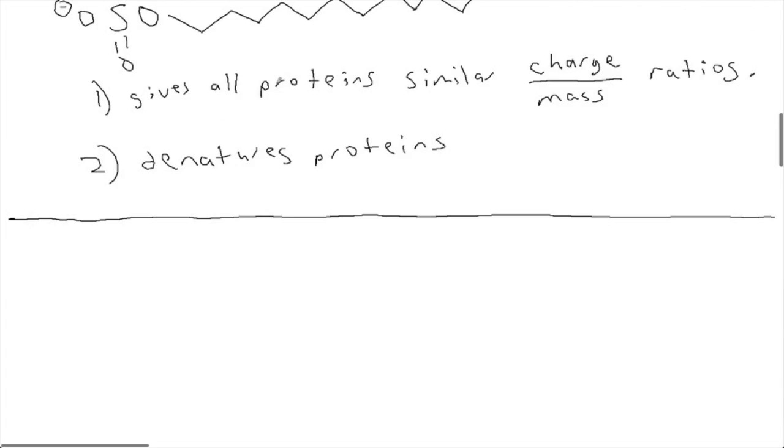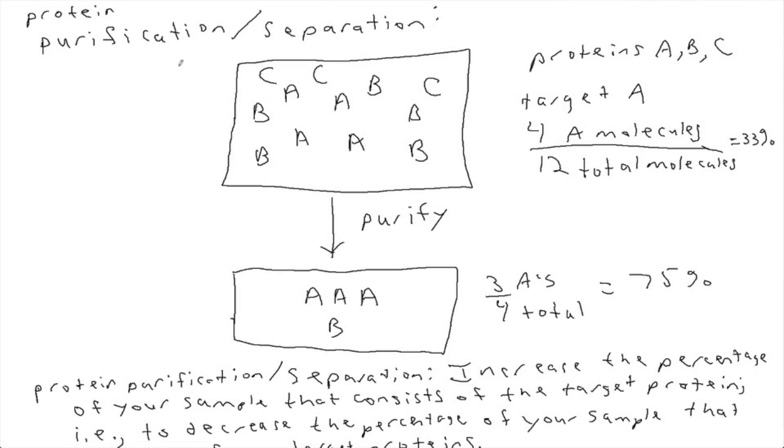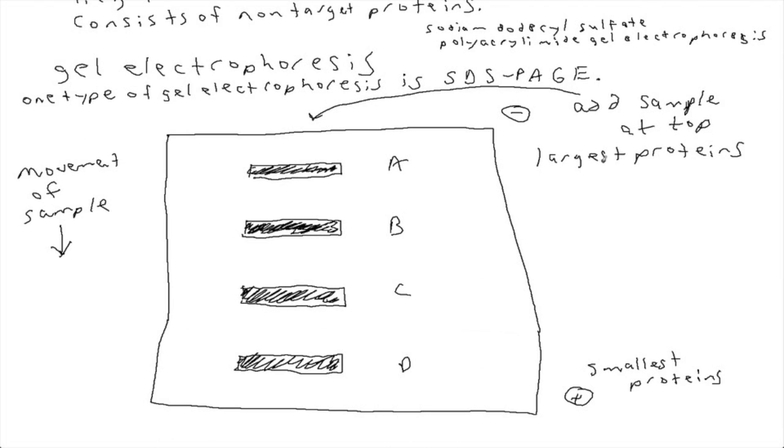Actually, before we do that, let's say one more thing about the electrophoresis. Would you agree that every method of purification has to exploit some difference between the proteins? If you want to purify your target protein, you have to use some characteristic of the target that's different from the other proteins. If they were all identical in every way, there would be no way to separate them. So what's the key characteristic that, say, the SDS-PAGE uses to separate proteins? SDS-PAGE separates proteins on the basis of what?